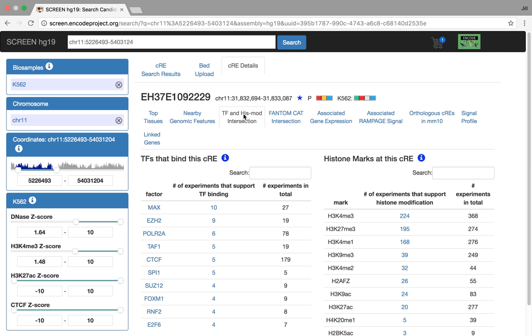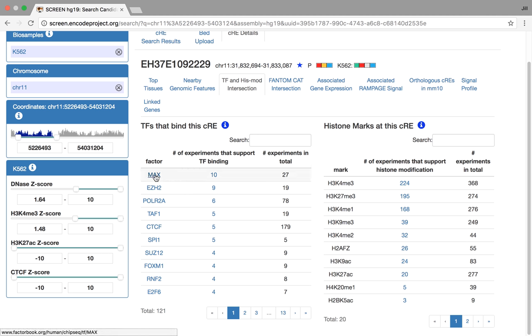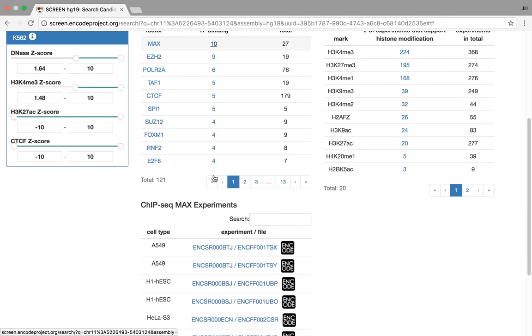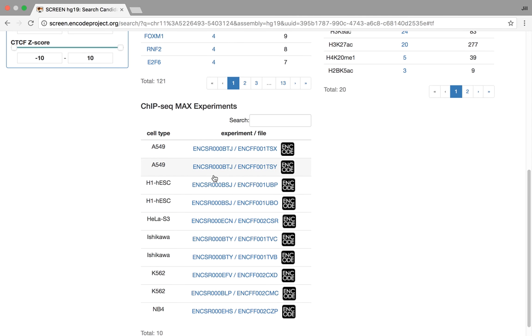Next tab, this is where we intersect all of the ENCODE project TF and histone datasets. So for the thousands of ChIP-seq experiments that are available, we're going to run through those, do a fancy bedtools intersect, and give you this list. So in particular here, there is ChIP-seq TF of max that has 10 experiments that actually intersect with this CRE. If you click on the 10, you then get all the experiments that are intersecting here, and you can click on the link and actually go and grab that file.